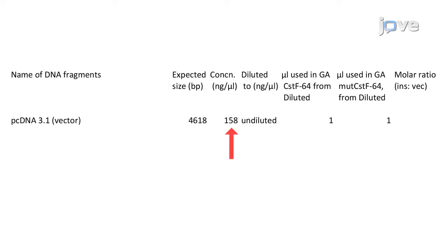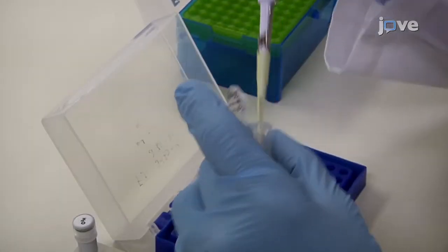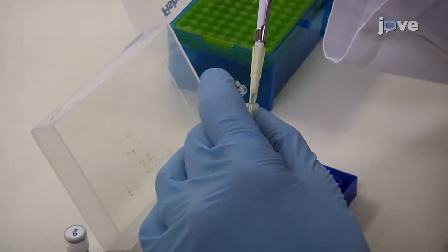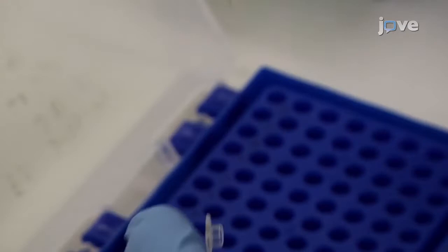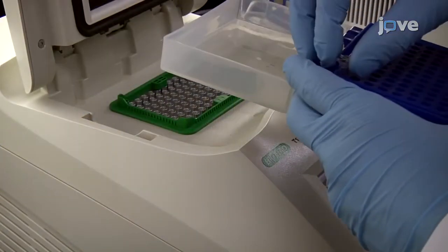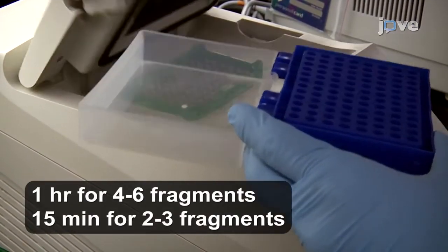Use at least 100 nanograms of DNA fragment representing the vector backbone or DNA fragment carrying the selective marker. Calculate the 3-fold molar excess for the DNA fragments that will be used as inserts. Mix the calculated amounts of DNA fragments in a PCR tube. Then, adjust the volume to 10 microliters. Add 10 microliters of the Gibson Assembly Master Mix. Incubate the reaction at 50 degrees Celsius in a PCR thermal cycler.